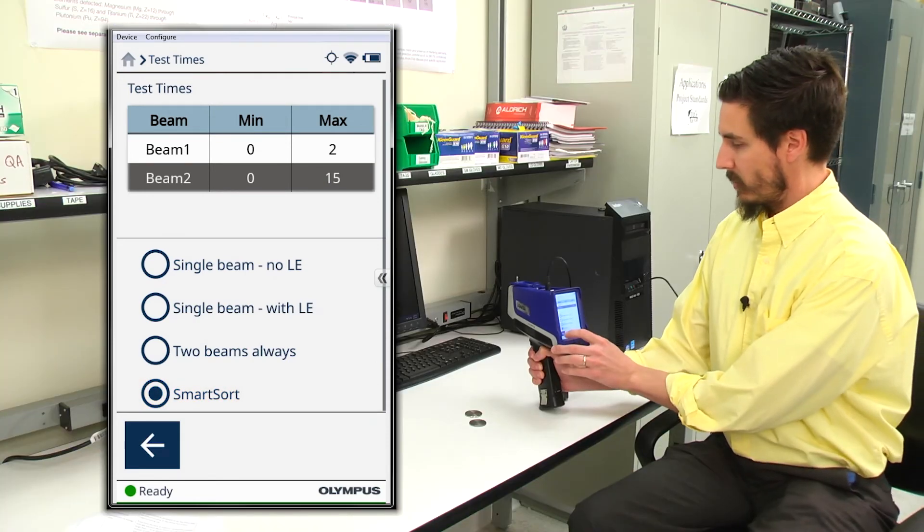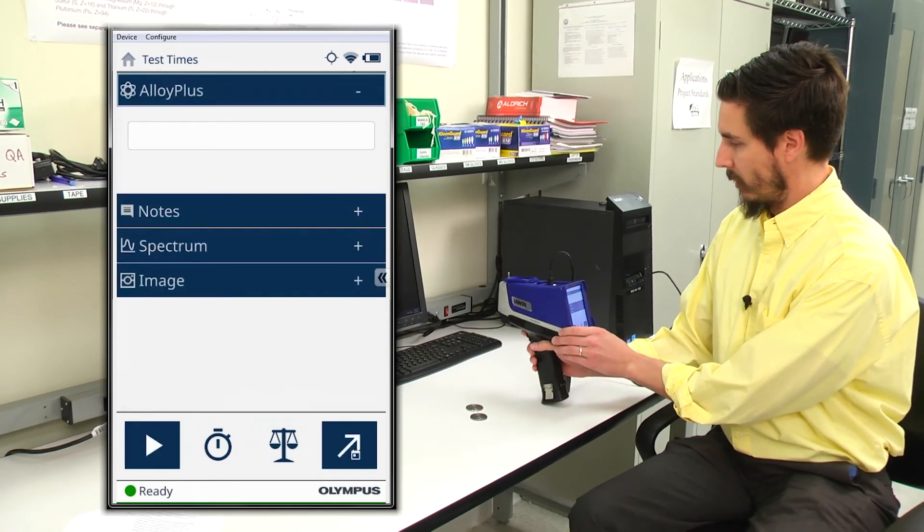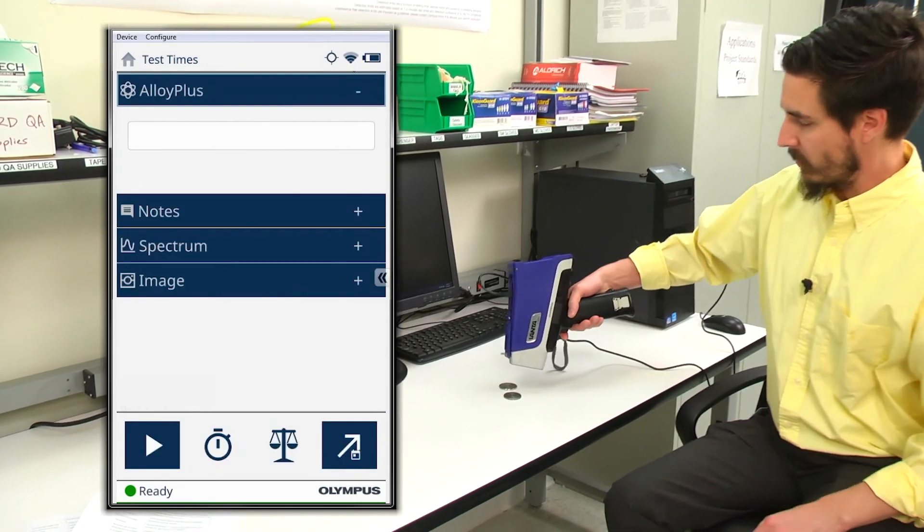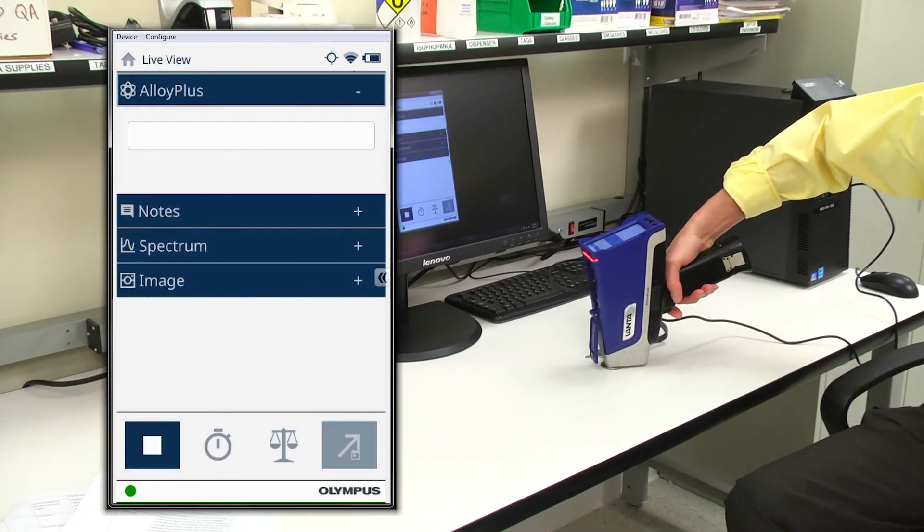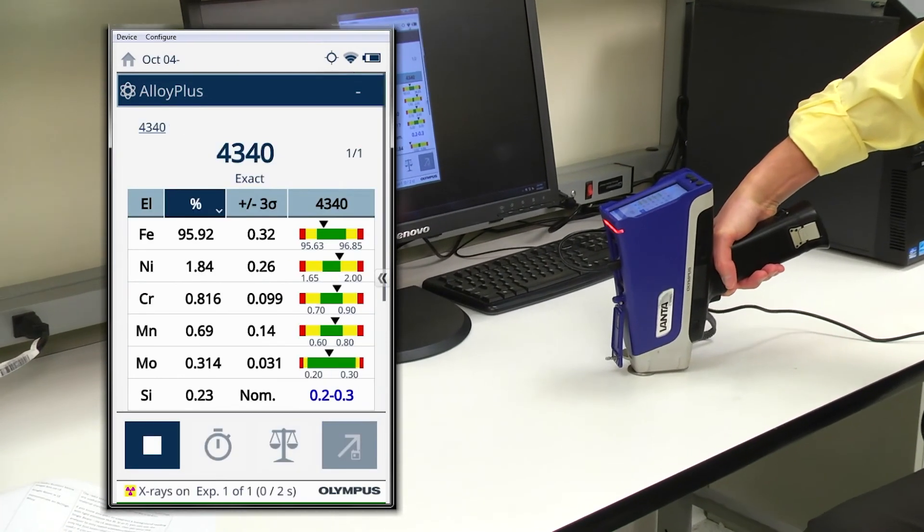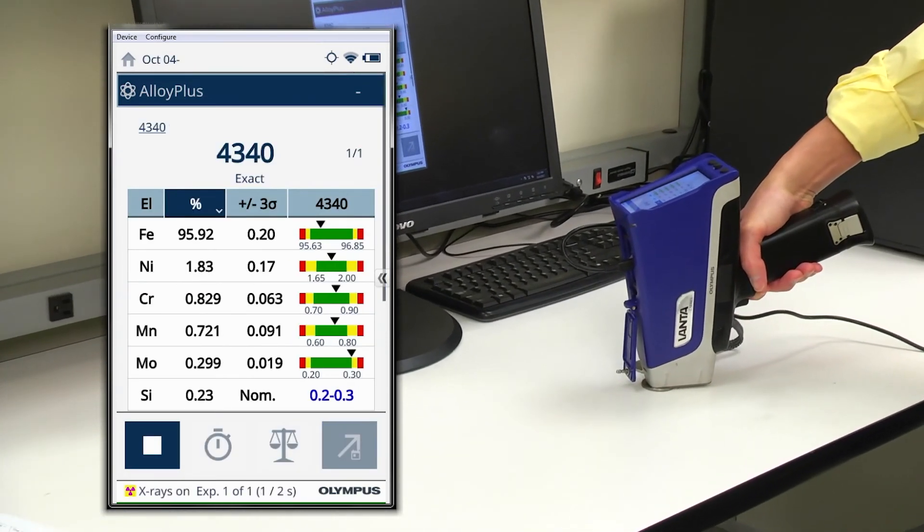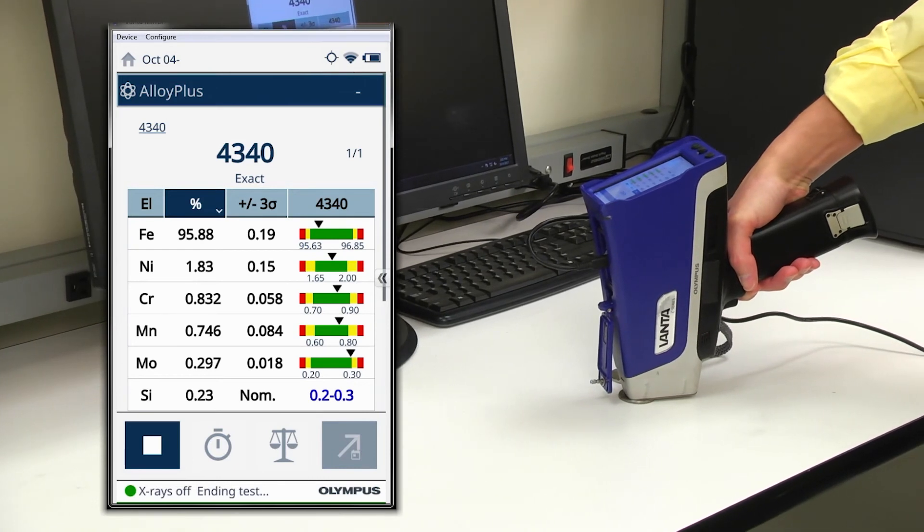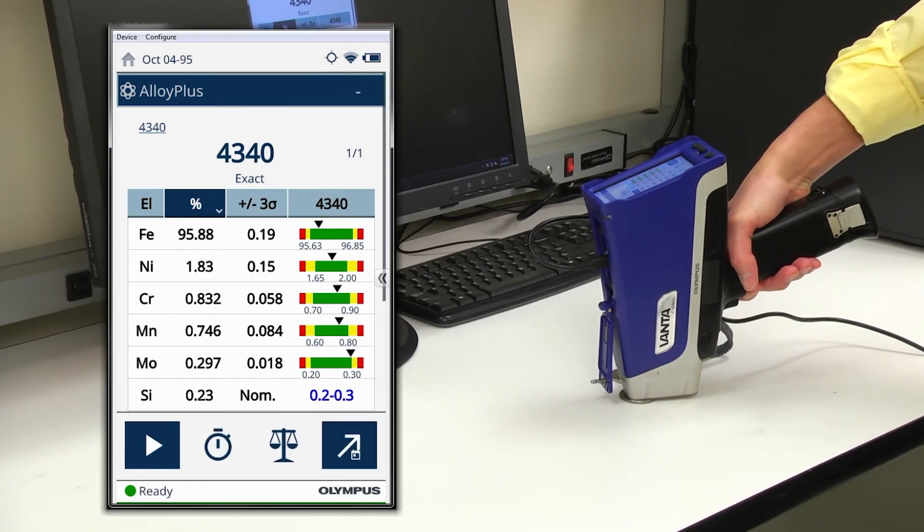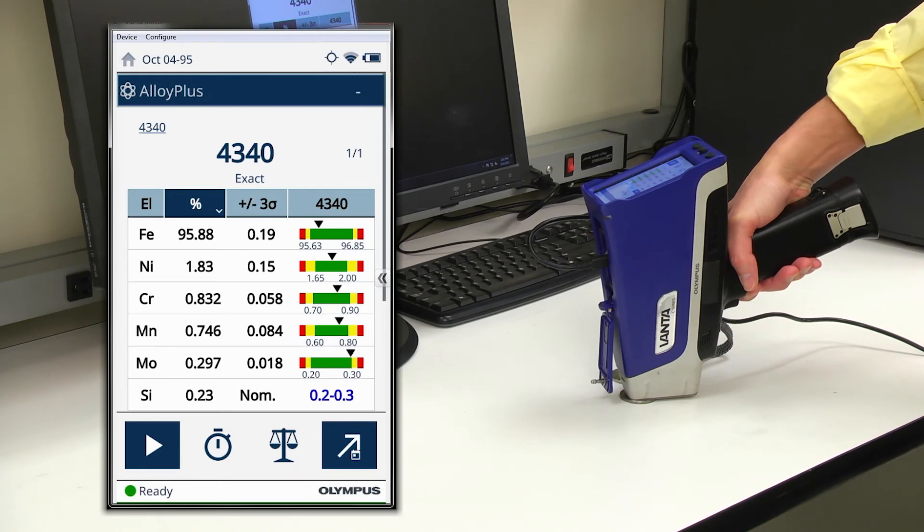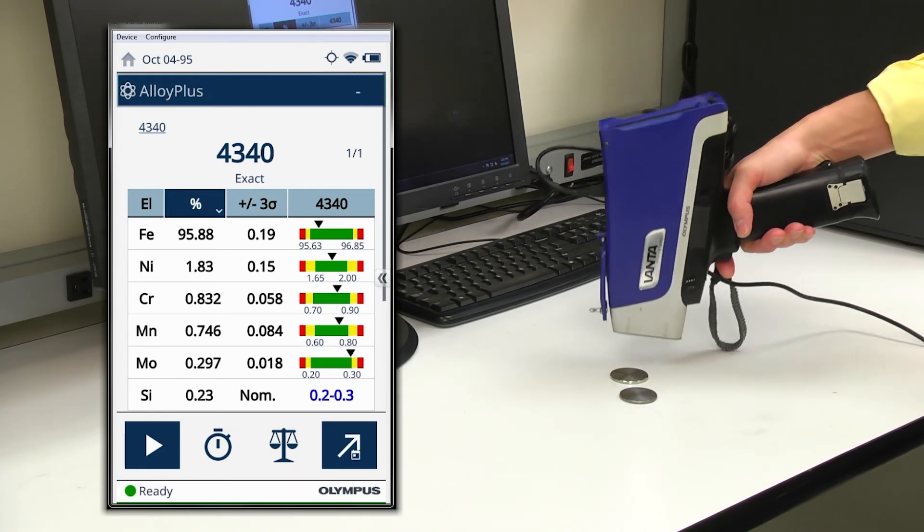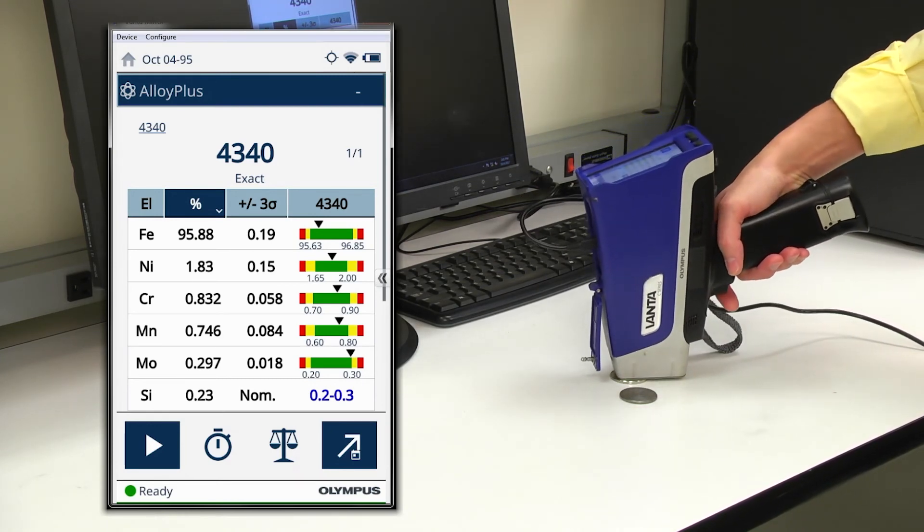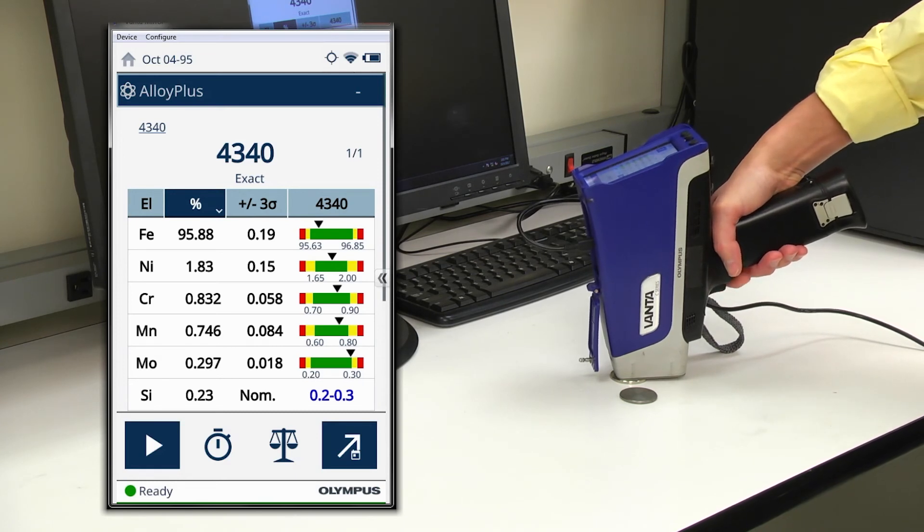So to demonstrate this, I have some alloy samples. By testing, I can see that in two seconds, I have an exact match for 4340 steel and no beam two operation is needed. So a very quick way to provide an exact match for this alloy.